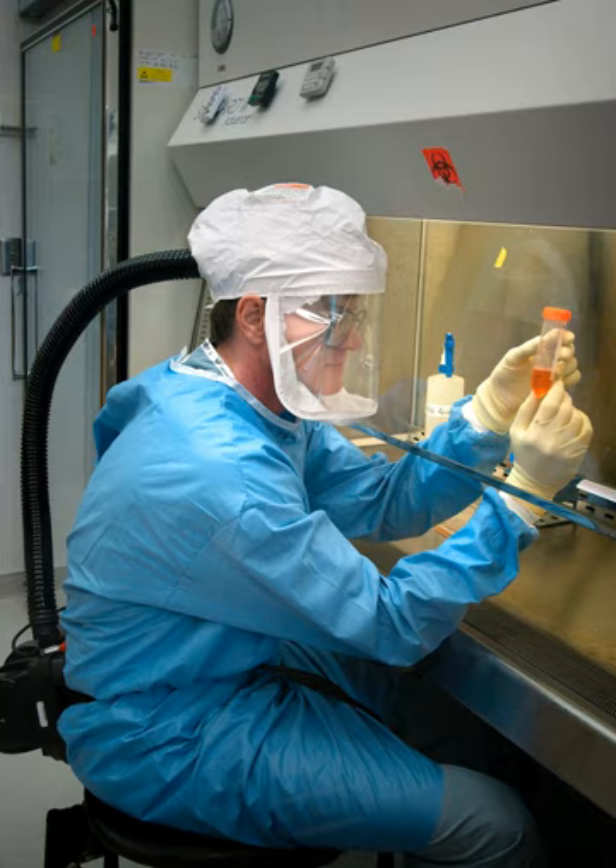The type A2 cabinet, formerly designated A/B3, has a minimum inflow velocity of 100 feet per minute. A negative air pressure plenum surrounds all contaminated positive pressure plenums. In other respects, the specifications are identical to those of a type A1 cabinet.